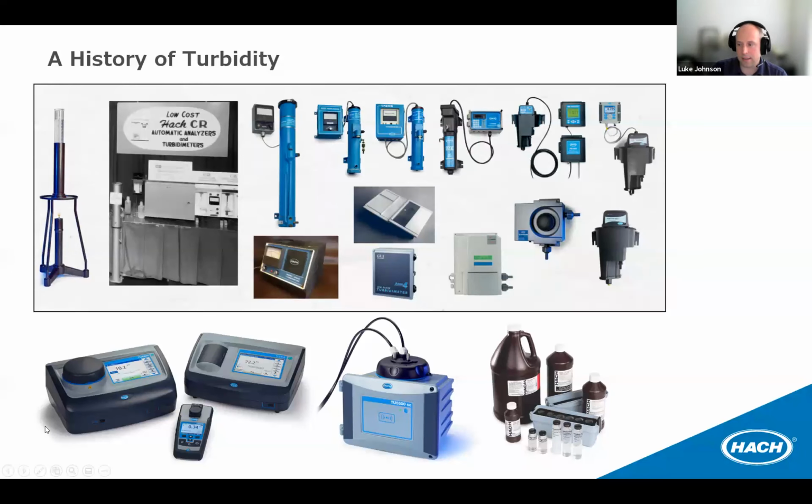So how has turbidity been measured, and how is it measured currently? This is really a history of Hach turbidity instrumentation right here. You can see we've been doing it for a long time. This is a candle turbidimeter through various iterations over the years, all the way up to our modern portfolio. So you can see that the measurement technology has come a long way over the years, and I'll go into more detail in the following slides.